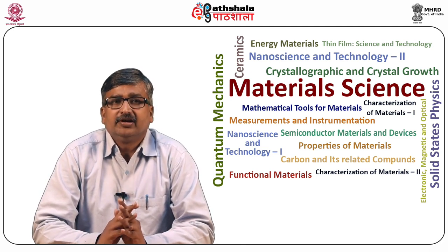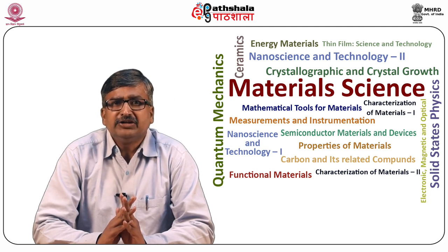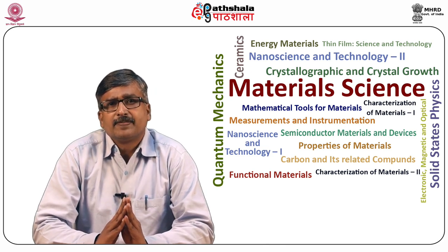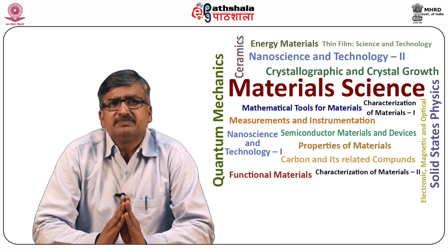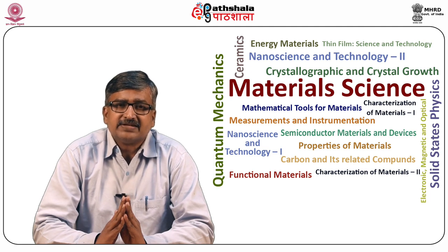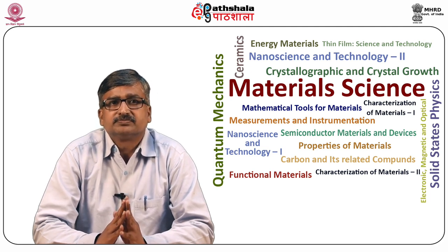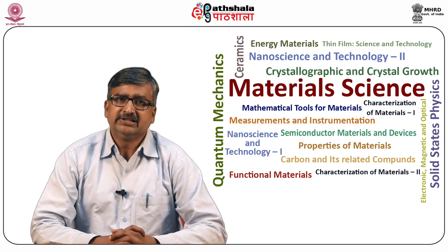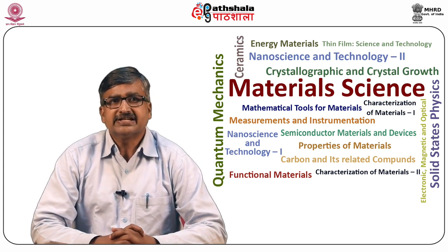TEM is a technique of characterizing material down to atomic limit. In order to find out exactly what new material we have made and how perfect it is, so that we can improve our synthesis method, this new synthesis method must be accompanied by atomic scale, compositional and structural analysis. The transmission electron microscope has emerged as a perfect tool for this purpose. It can now give us atomic resolution image of material, their defects, together with spectroscopic data and diffraction pattern from some nanometer regions.